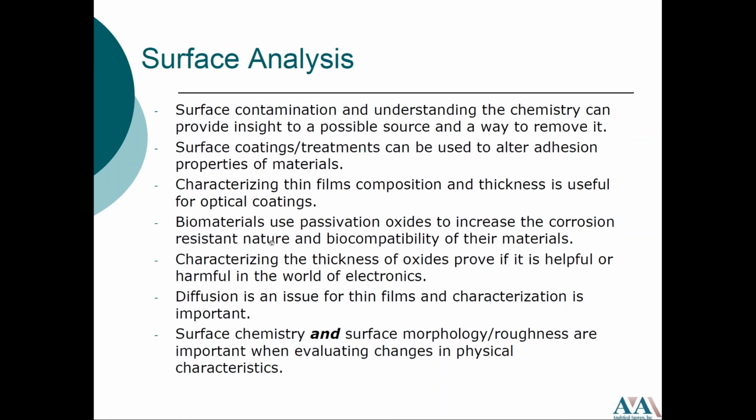And then the last thing we talked about was how surface chemistry and surface morphology are important things to consider when you're talking about physical characteristics. And when both are in question, SAM or Auger is the ideal technique to use.